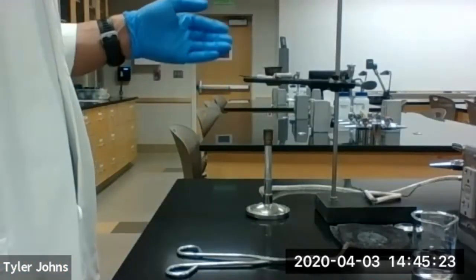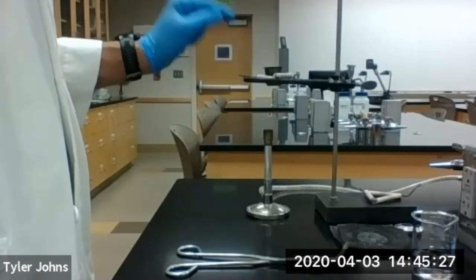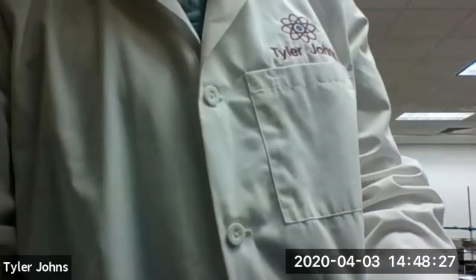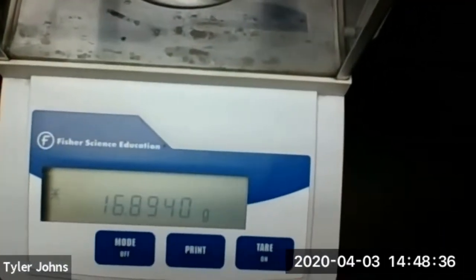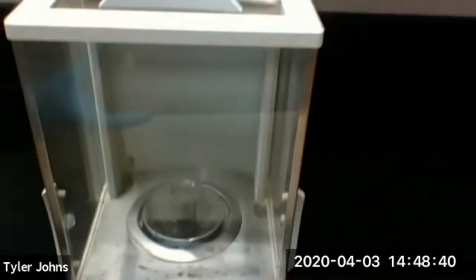We've allowed our crucible and cover to cool, so now we're going to weigh the empty dry crucible and the cover on a digital balance. The weight of our dry cooled crucible and cover is 16.8940 grams.